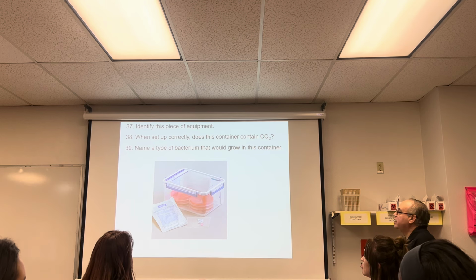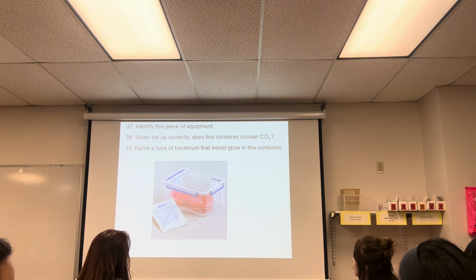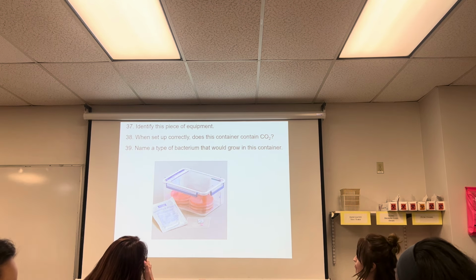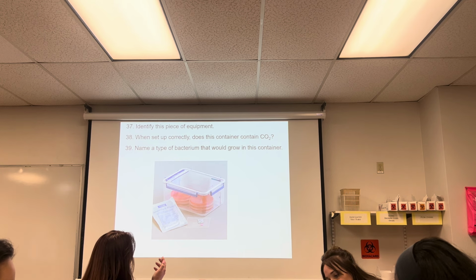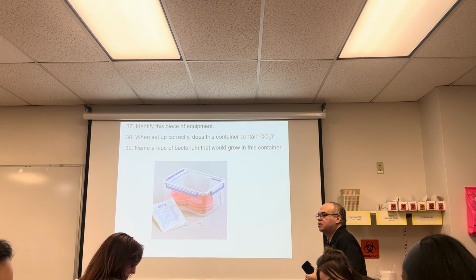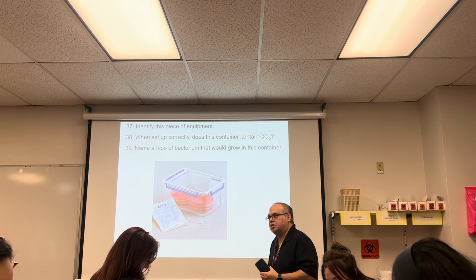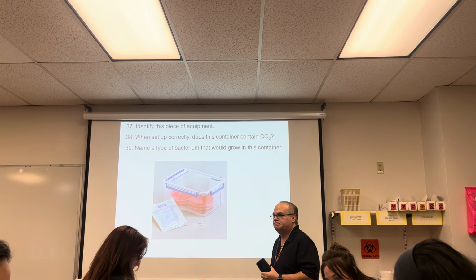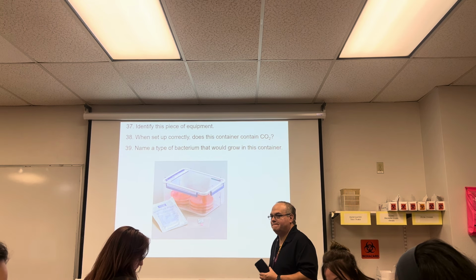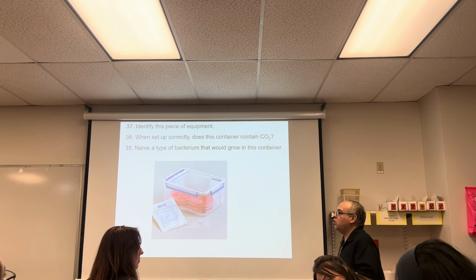So, when set up correctly, does this container contain CO2? Yes. No. It is completely anaerobic. There's no oxygen in there, so there can't be any CO2. CO2 comes from the liberation of the organisms' aerobic respiration. These are anaerobes. Okay? All right, so name a type of bacterium that would grow in this container.